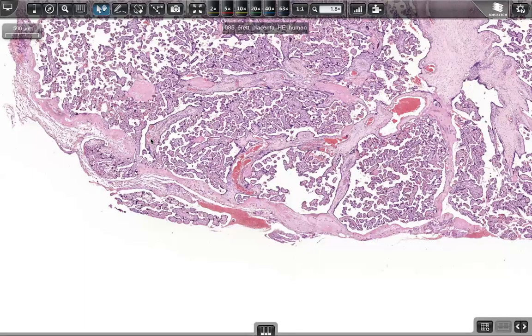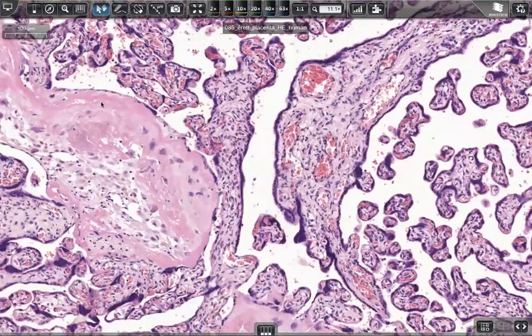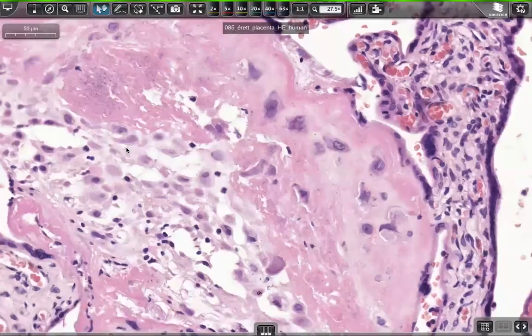It's approximately a 20 centimeter big discoid structure, and on the maternal side we can find 15 to 20 lobes separated by the connective tissue septa. There also are cellular elements, beautifully seen. Small cells and big cells. So these are the decidual cells again.